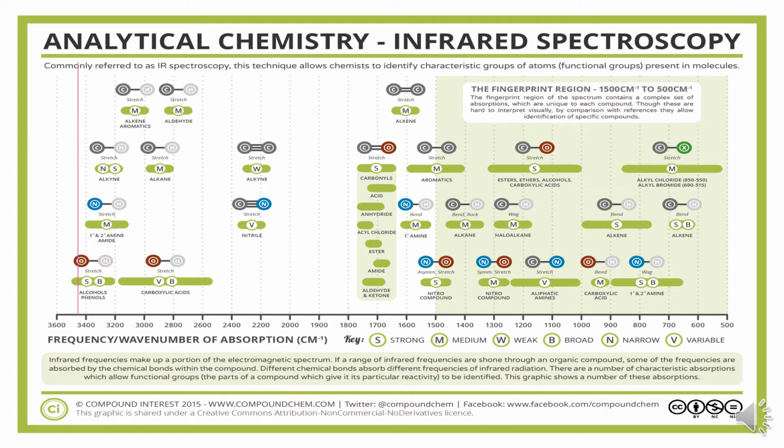Also recall that we still have one nitrogen that we have not yet accounted for. And so if we go over one group, we'll see that there's the primary and secondary amine and amides, which is very close to our wave number and has the nitrogen that we have yet to account for.